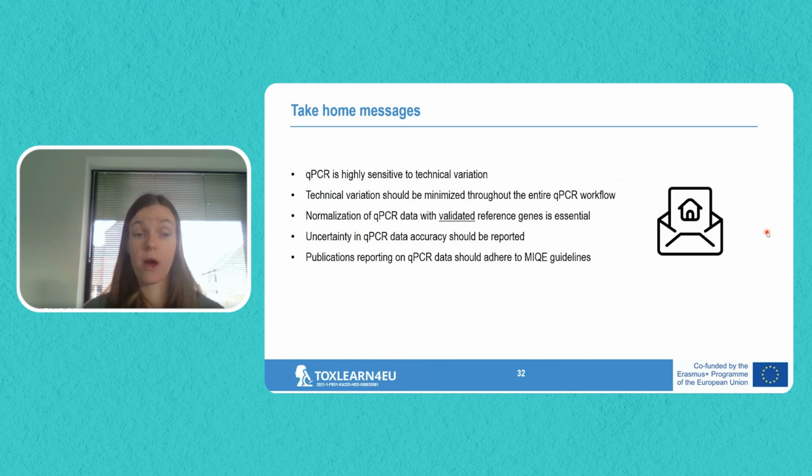And when publishing qPCR data, you should always adhere to these MIQE guidelines and fill in the MIQE guidelines checklist on all the parameters or all the experimental details regarding the qPCR experiment that you performed.